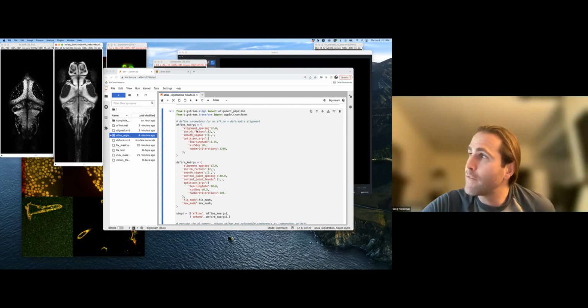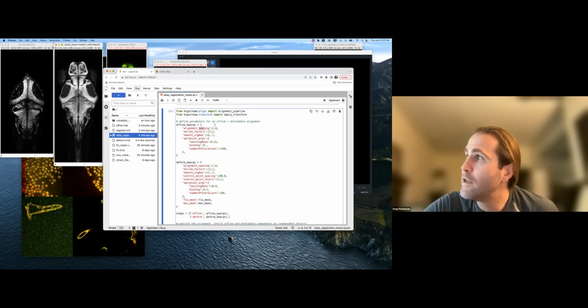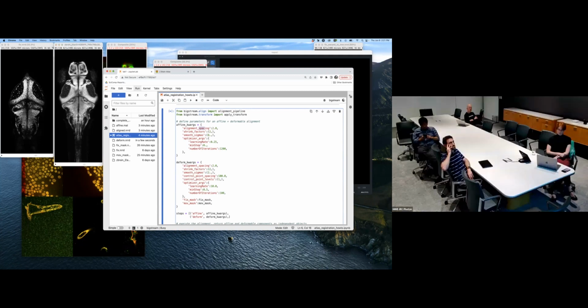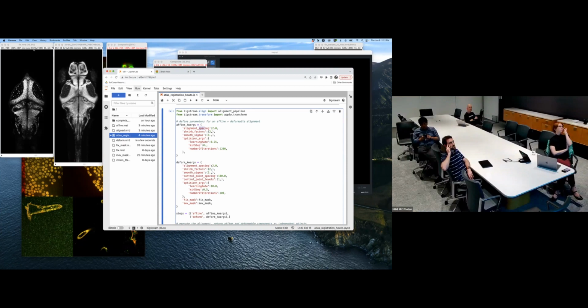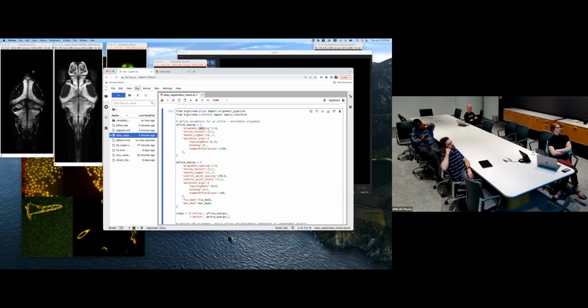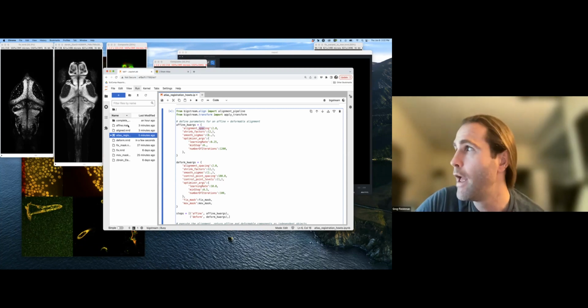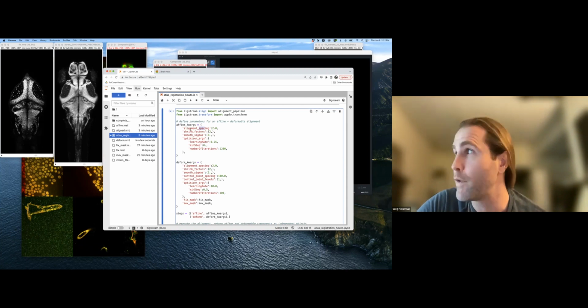The second thing that I play with a lot, in a related way, are the shrink factors and alignment spacing. In different ways, these two numbers control at what resolution the alignment is actually done. So this fixed image, for example, has 210 Z slices, 1,025 X pixels, and 1,945 Y pixels. That's a lot of pixels overall, volumetrically. We don't need all of them in order to align accurately. We can downsample a lot. And these two parameters in different ways control how that downsampling happens.